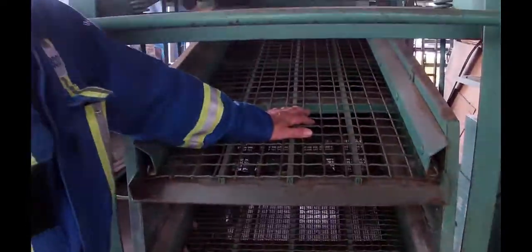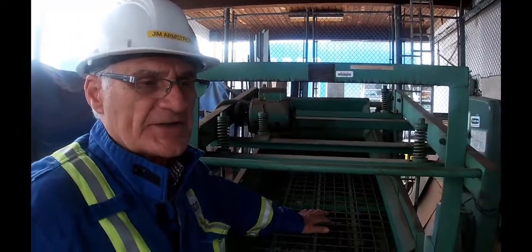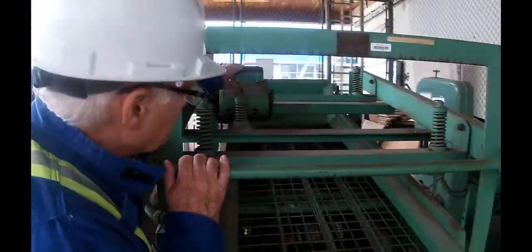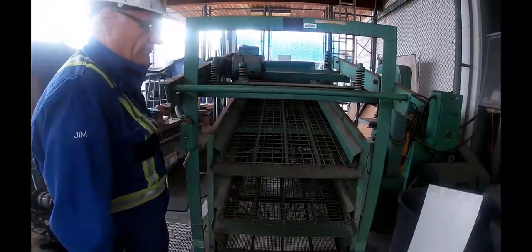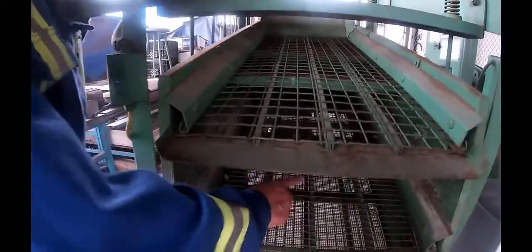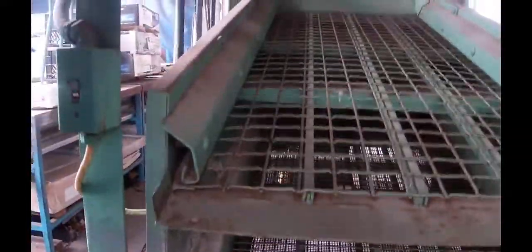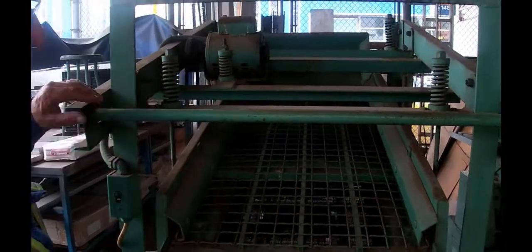Anyway, so the stuff that comes off of here and off of here is going to land on our floor. In the mill, this would be dropping onto a conveyor and go up into a chip silo, and the screen chips would sit in that chip silo until they're needed over in the digester. So I'm just going to start this up so you can see how it works. All it is, it's just a motor sitting on here with an offset cam on it, and it causes this thing to shake. So now you'll see it starting to vibrate. Okay, and you can see there's still little tiny bits of wood stuck in there. And these things will shake off of here and drop down. The fines are going to end up going through the bottom one and back in behind. The accepts will come here. Normally there would be another plate on here to catch the big ones, but we just simply grab them as they're coming along.